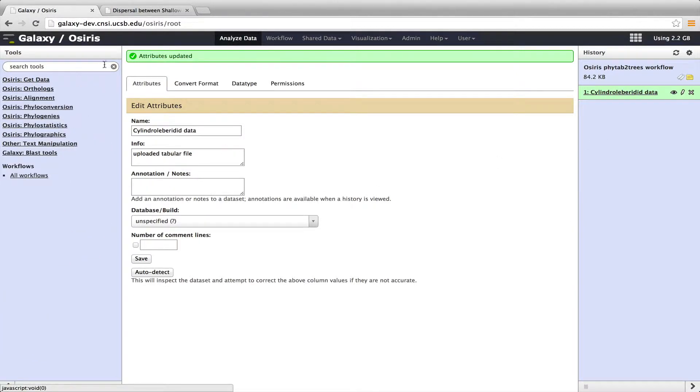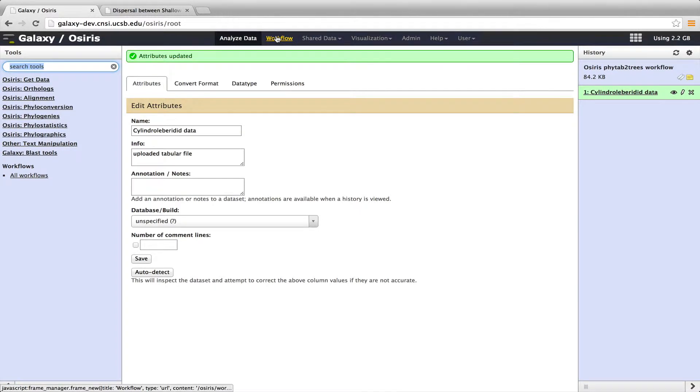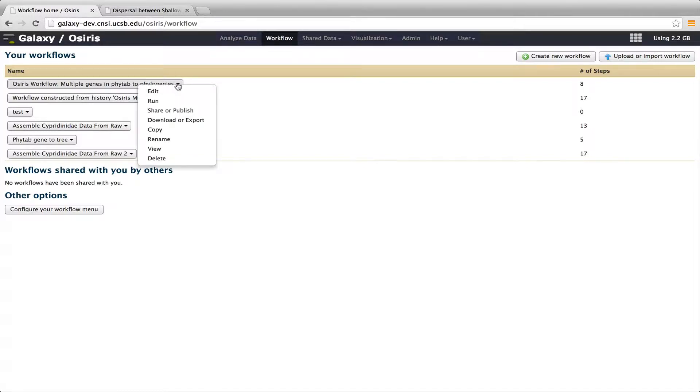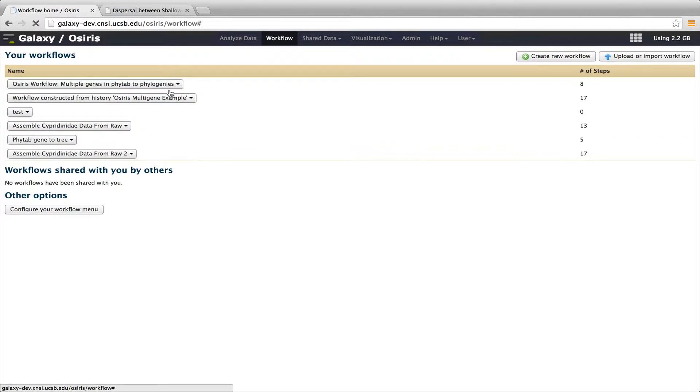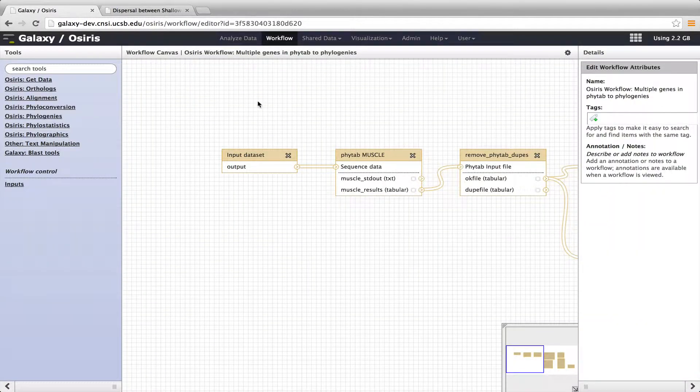So I can select other tools to analyze over here, other OSIRIS tools, or I can select a workflow. Before I select that workflow, I'll show you what it looks like. So up on the different tabs up at the top here, I will click on Workflow, and I have this one here, OSIRIS workflow, multiple genes in PHYTAB to phylogenies. So I'm going to do Edit to be able to view it.